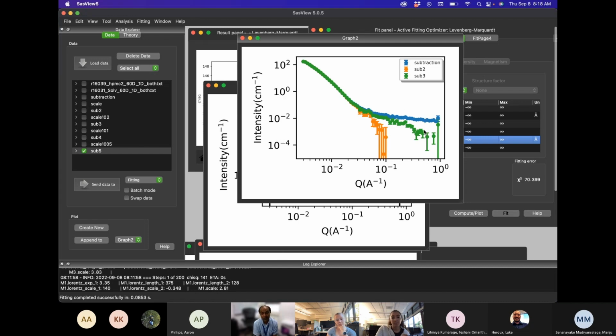I would definitely do more subtraction of background. That could be a Guinier there. So that will tell you a rough size of your individual segments. Within this area we could fit a Guinier. And the low Q could be your larger domains or aggregates. And within the aggregate, you have smaller building units, and those units are here. It may be a cylindrical shape. You could try that.